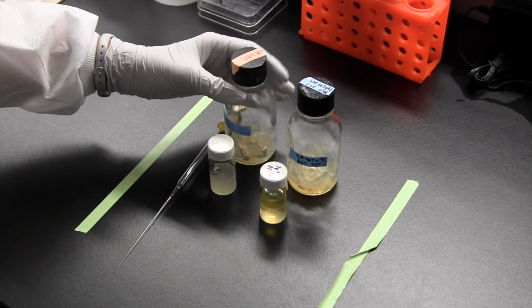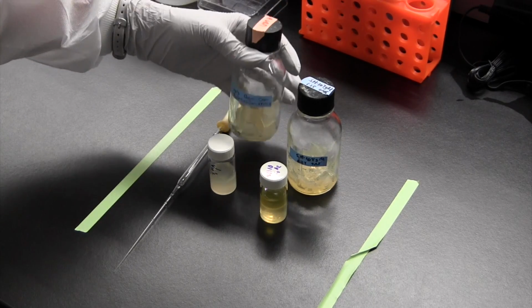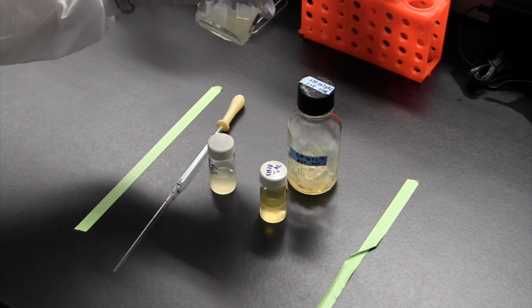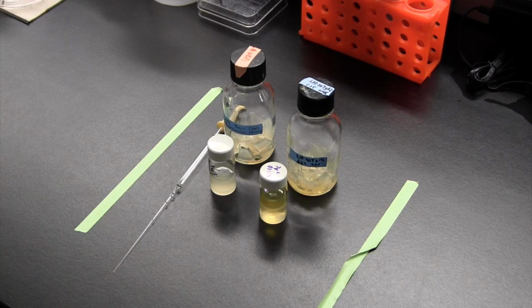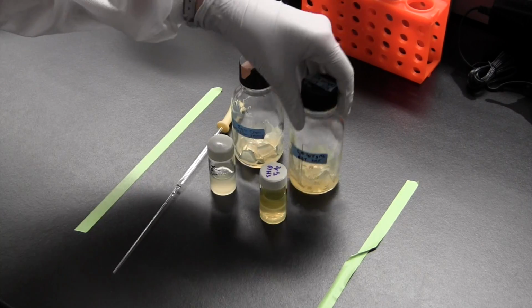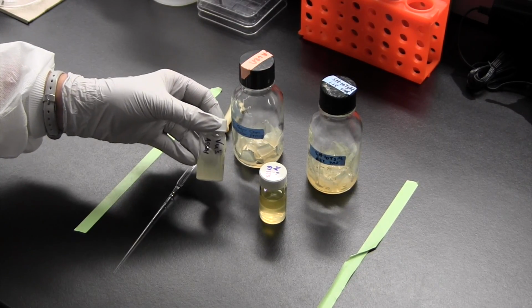So at this point, we have added our ethyl acetate in the last section, and then it was shaking for roughly 3 to 4 days, and your students can work in the hood to remove the extract from the bottle or at the bench. At the bench, obviously be sure that the students are wearing all of the appropriate personal protective equipment, including eyewear and gloves when working with the ethyl acetate, along with the lab coat. So what you can see here are 2 bottles, and these bottles have been emptied into small 20 mL glass scintillation vials.